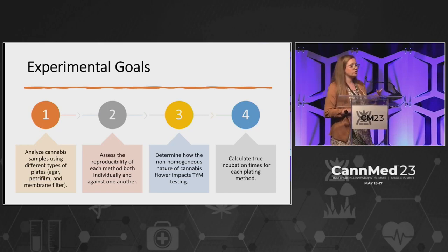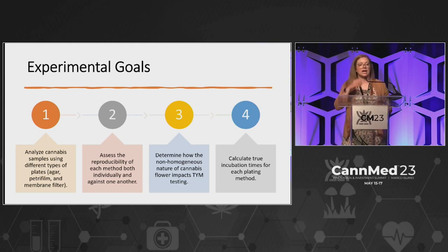And then also to establish true incubation times for each plating method. A lot of the different manufacturers that produce these plates make recommendations. Incubate for 48 to 72 hours. Well, guess what?